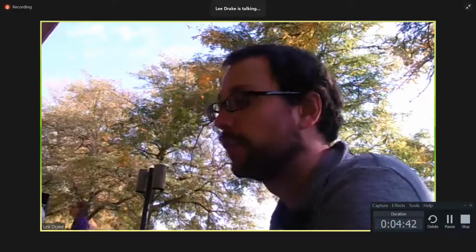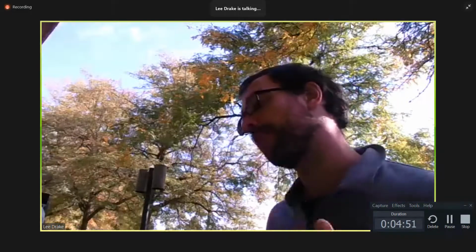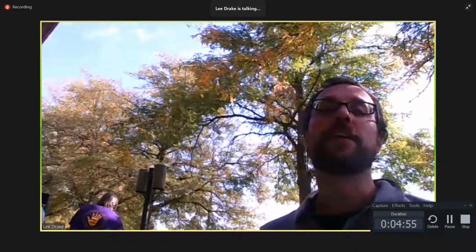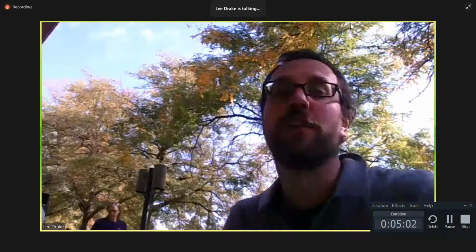My objective today is to begin with an introduction on how we use XRF and with some basic examples. And then later this afternoon, we're going to go through and look at various objects with cultural heritage. Now, we wanted to make this an open event for everyone to enjoy. But at the same time, the thing to keep in mind is that we are trying to fulfill the purposes of a grant at the same time. So you might see us really zone in on a couple different features here and there as we continue.